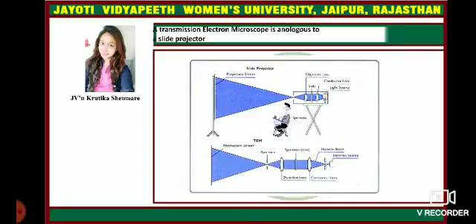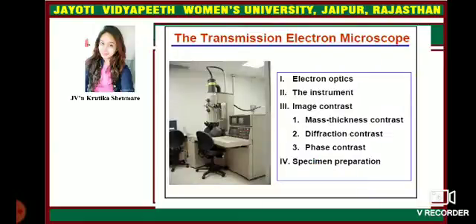A transmission electron microscope is analogous to a slide projector, as shown in the figure below. The transmission electron microscope consists of the electron optics, the instruments, the image contrast, that is mass thickness contrast or diffraction contrast or phase contrast, and specimen preparation.